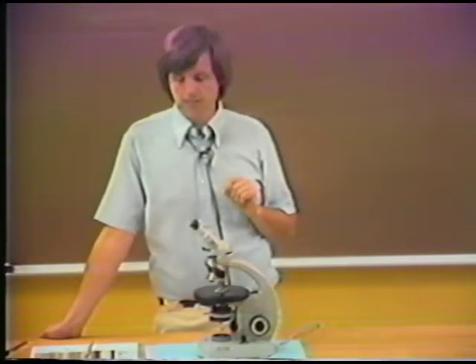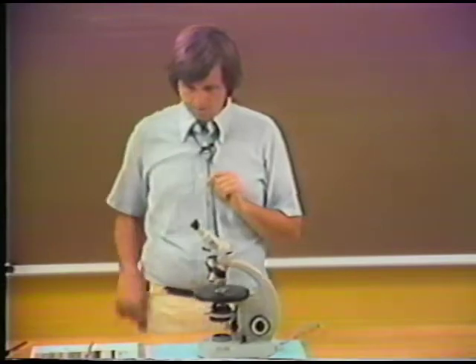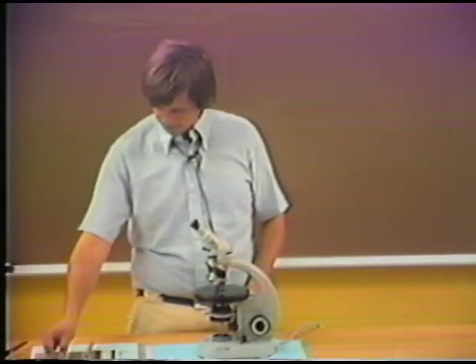Extinction is a phenomenon which occurs, of course, four times in rotation with every anisotropic mineral. But there are different kinds of extinction when the extinction can be compared with some reference position on the mineral. A reference position related to its crystallographic form, as expressed by direct crystallographic shape of the mineral, or by cleavage. And so I'm going to give you some examples of different types of extinction, and we'll move to another mount.